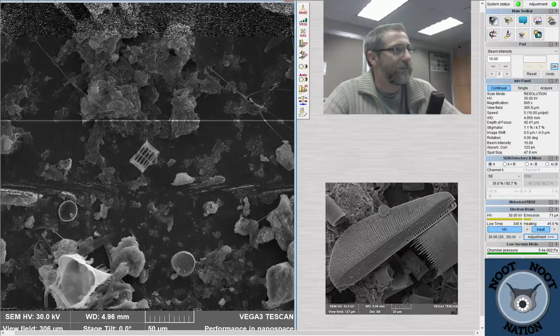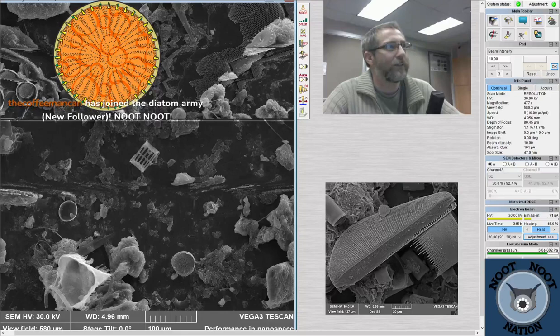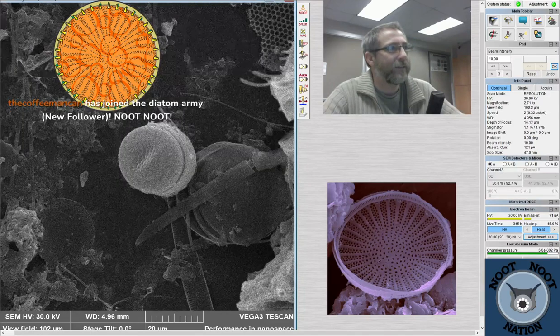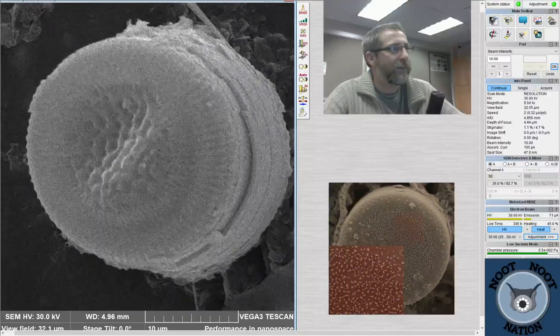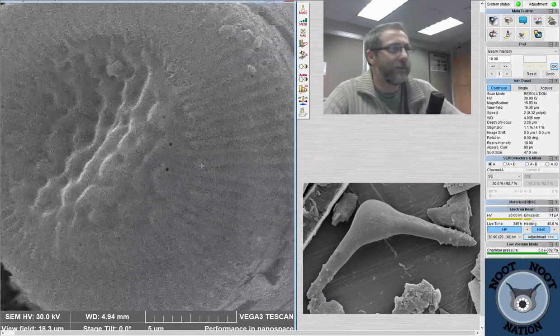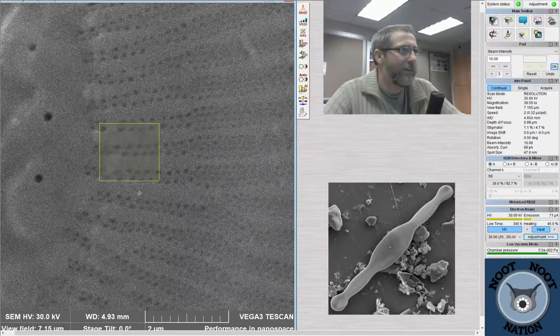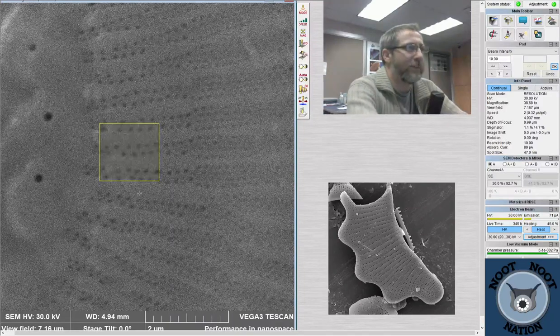So let's get back in the business of finding cool diatoms. If we see another Skeletonema, I might stop in and take a look at it. Oh, this is a little invader right here. We didn't have to go very far for that one. This is, I think, Cyclotella striata, probably. The good news is that it has little holes, and I know what they're supposed to look like. See how they make little ovals when I turn the knob? The stigmation is supposed to be trying to fix that problem.